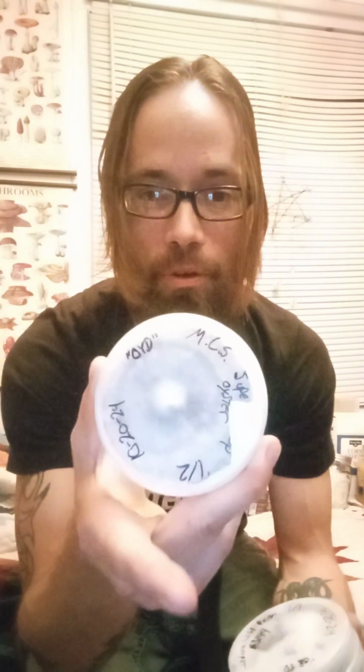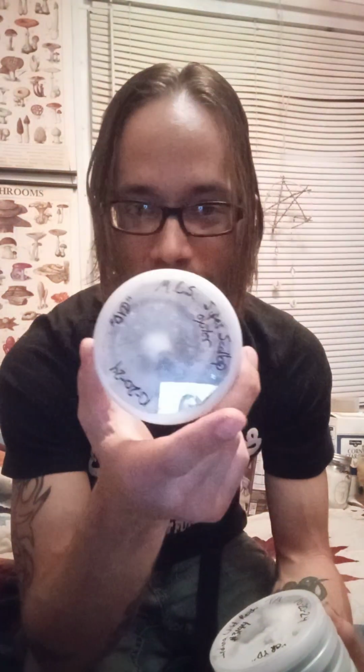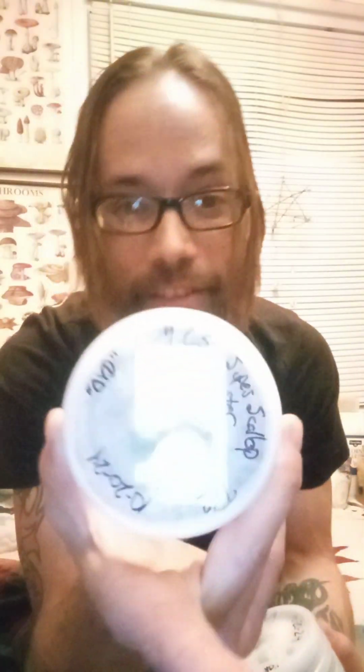And then here are these plates, which are actually all overgrown now, but this is main cap and stem super scallop oyster. This is grown on oatmeal yeast dextrose. The rate of growth was real nice. It grew up pretty fast and aggressively, and actually responded really well to this. Now it's totally overgrown, starting to get a little concentric, and it looks like it might even be getting ready to pin on the plate.